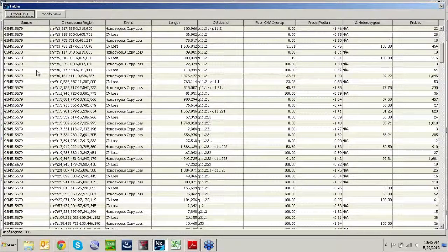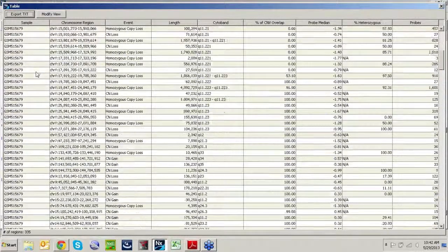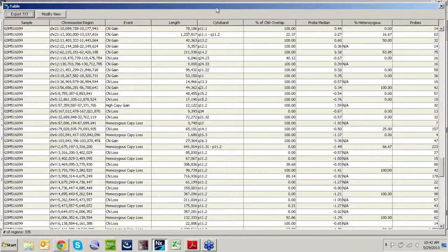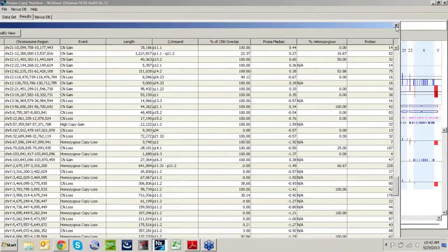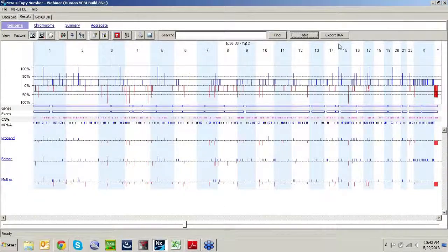Took all of these calls and created a table just of these chromosomal regions. So it's basically just modifying this TXT exported file and dropped it into the correct folder, and I can now load that as a bed file. It is, again, a really simple, easy process.